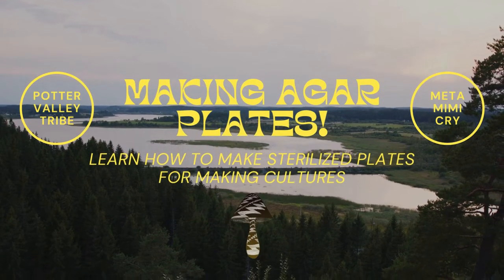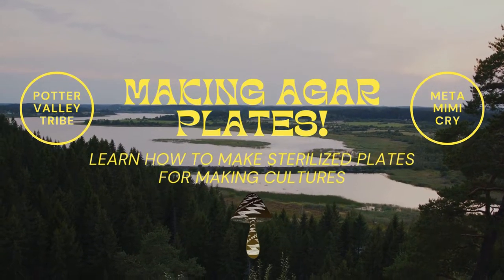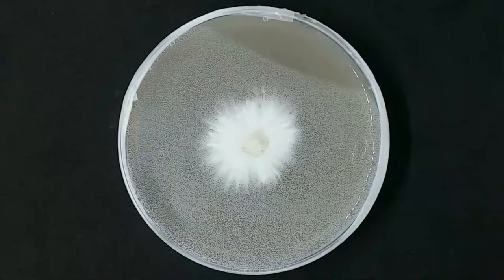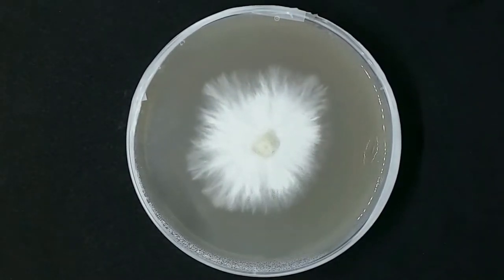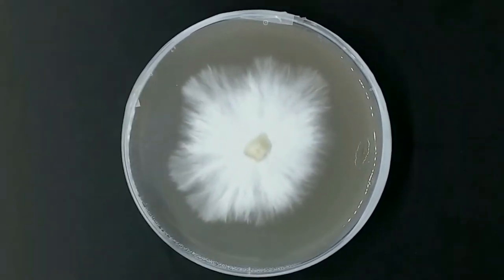Once you've collected a mushroom you're interested in culturing or growing, you'll need to prepare some agar plates. The purpose of this process is to create nutrient-dense and sterile substrate for the mushroom tissue to begin growing out as mycelium again.